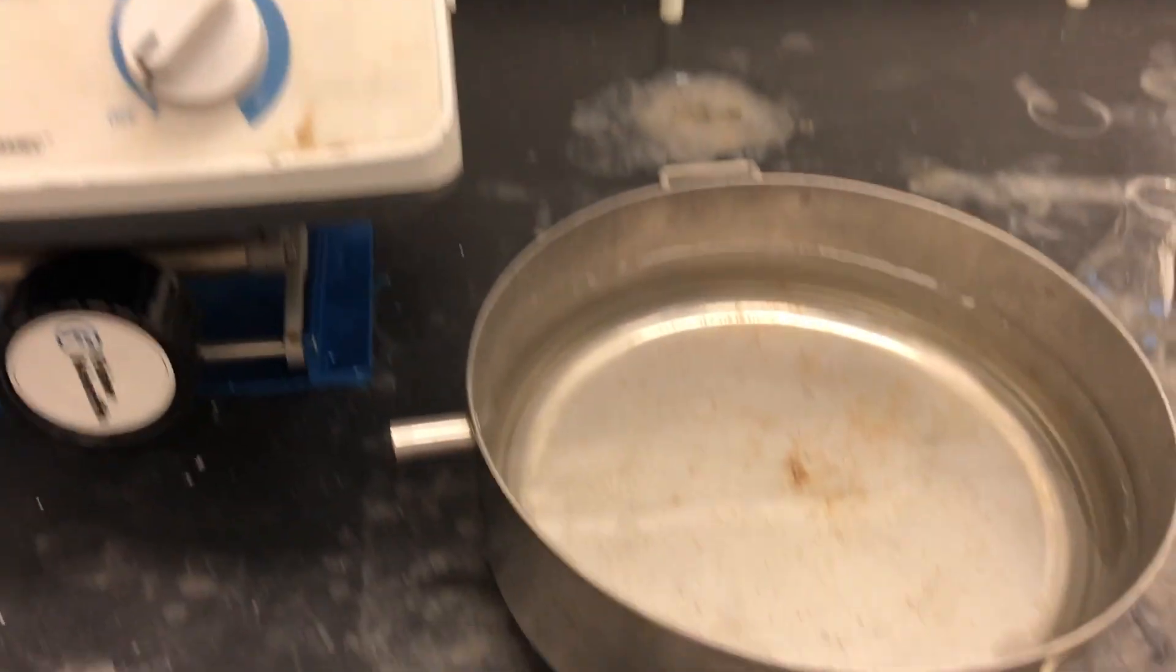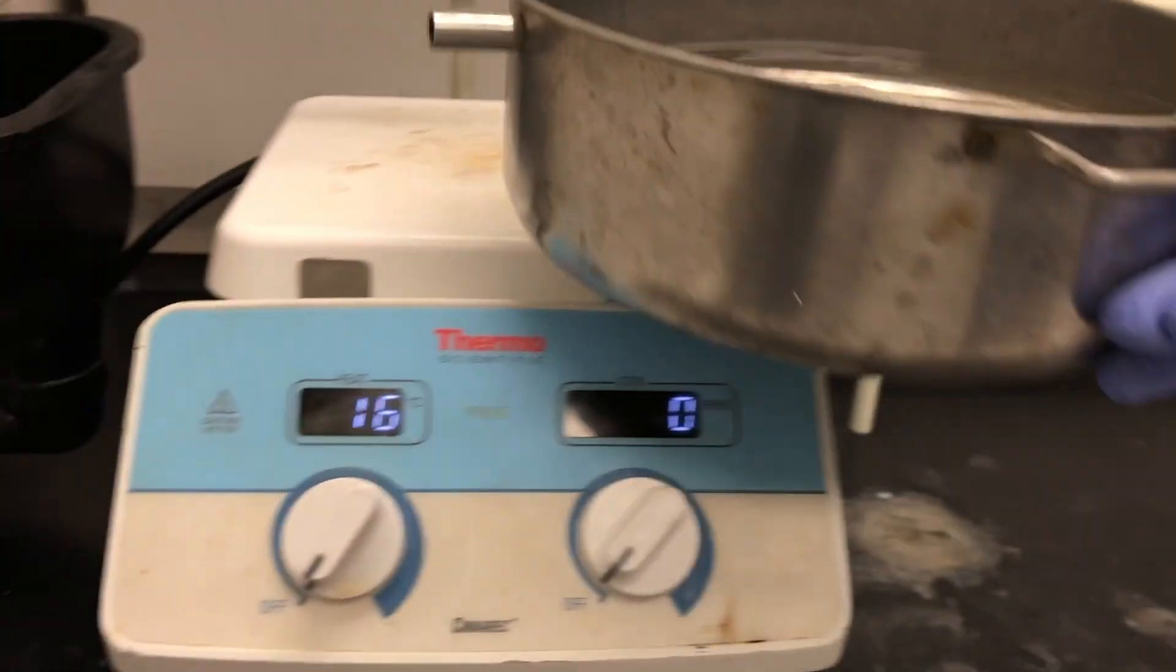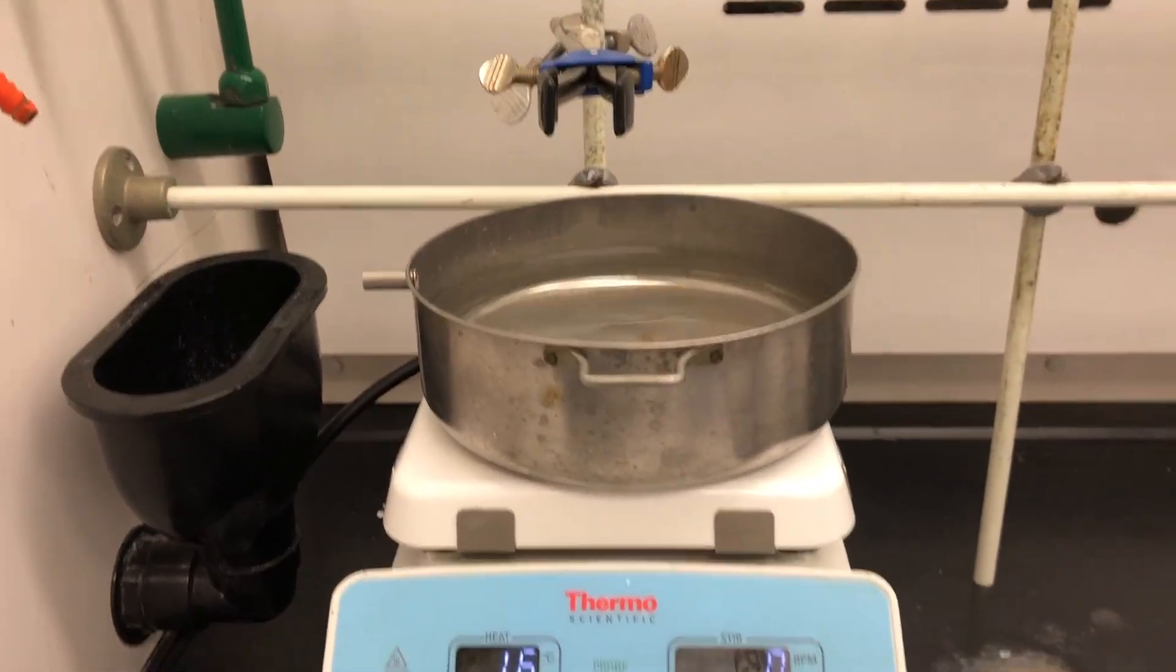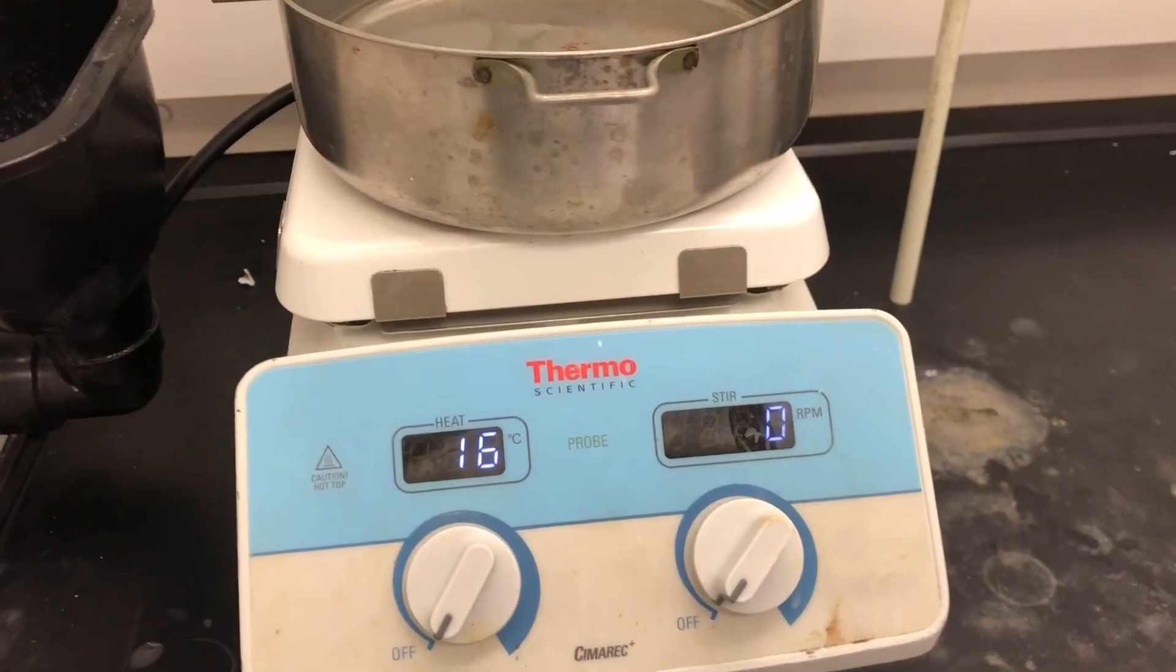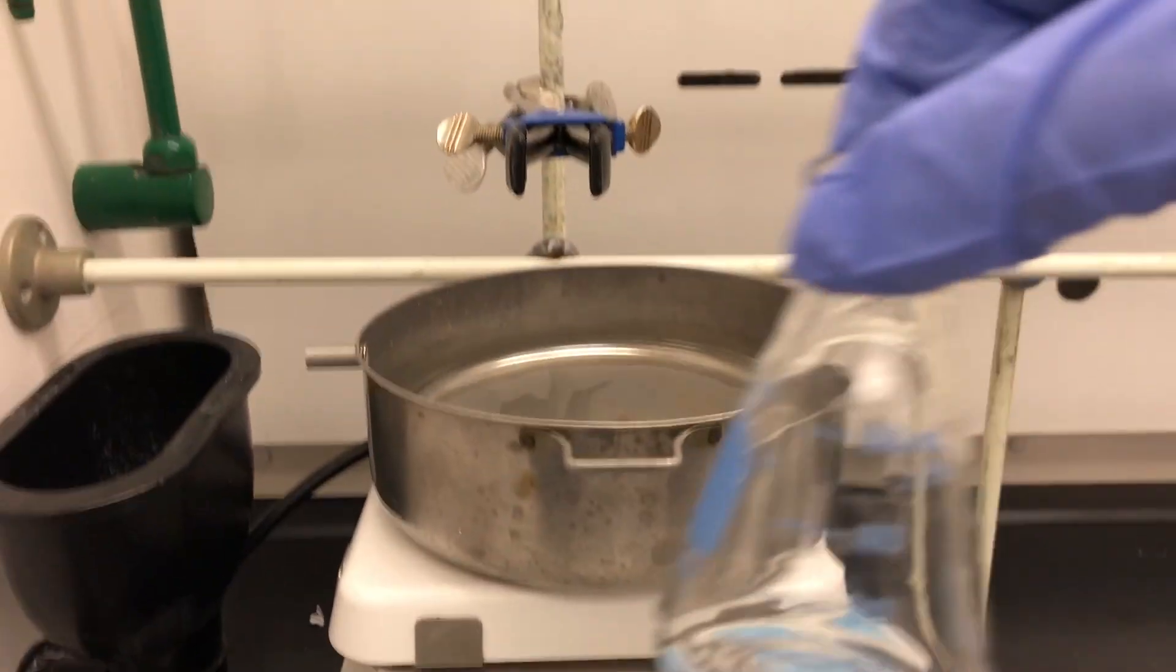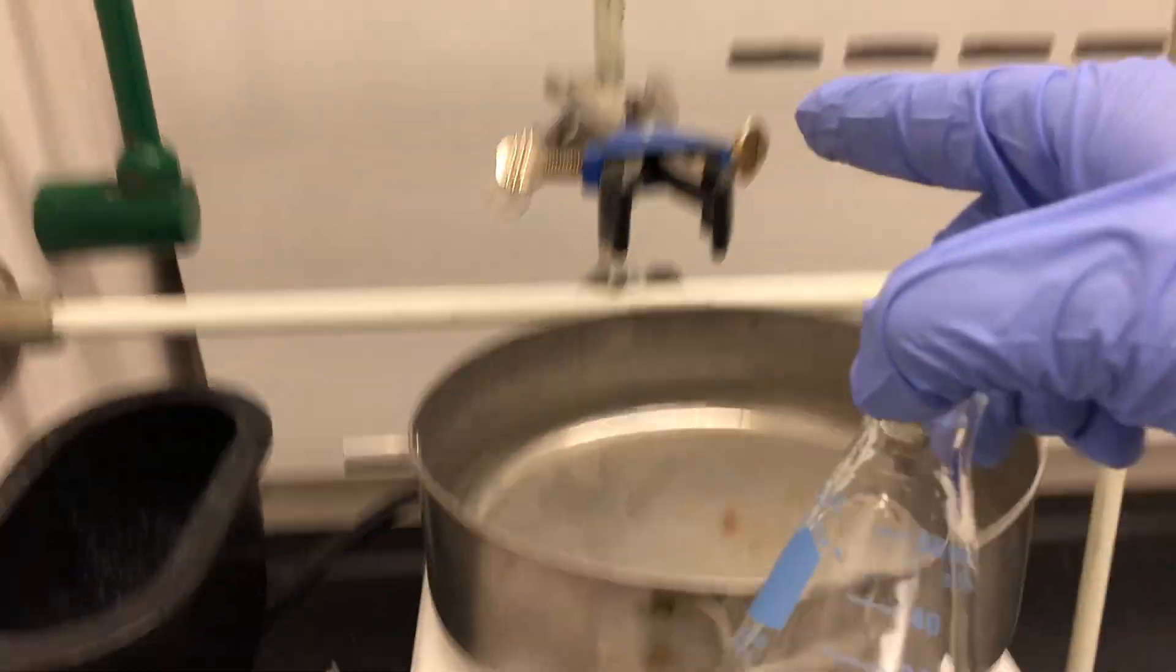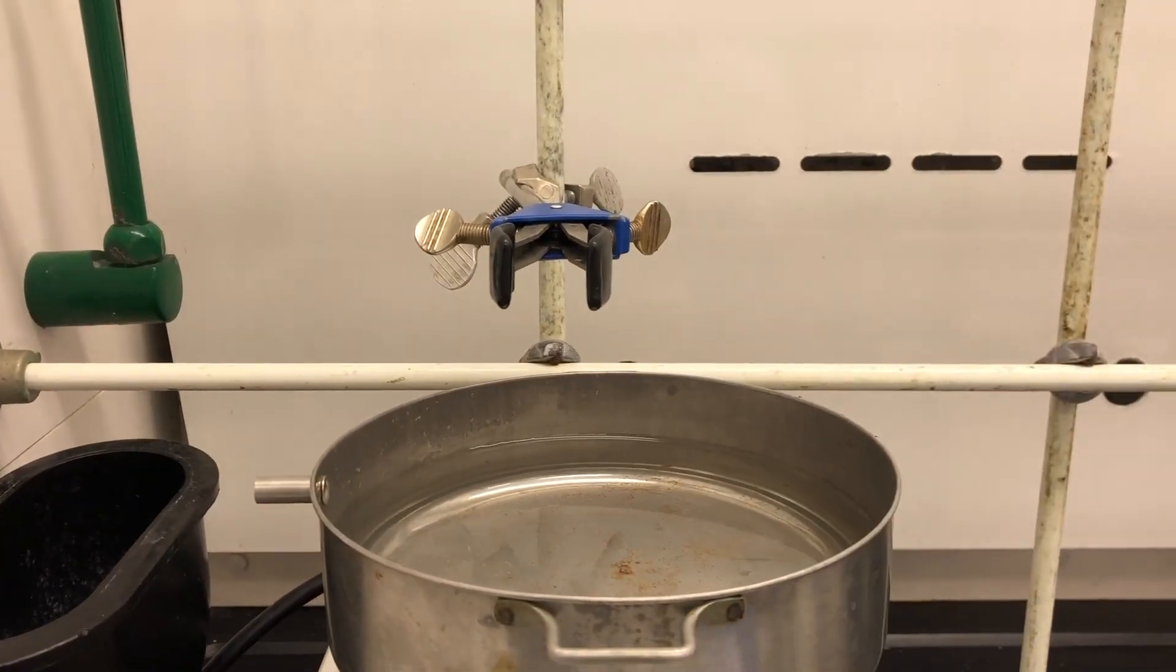We're going to fill the stainless steel bowl with water and heat the water to around boiling temperature. We'll gently stir the reaction mixture once we place it on our 50 milliliter flask. We'll clamp it right there and let it sit within the water bath.